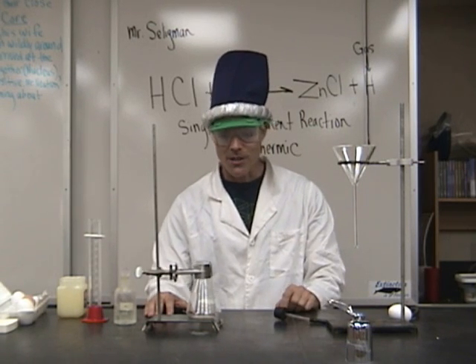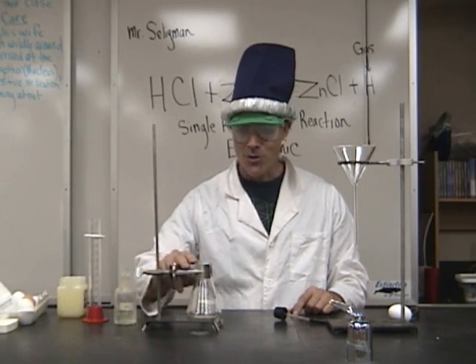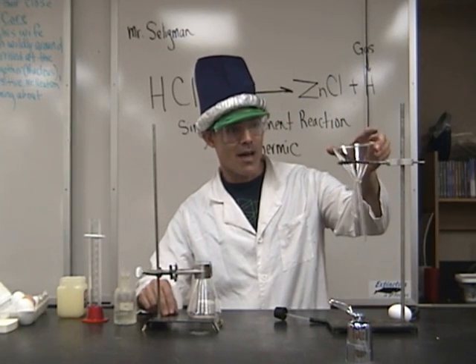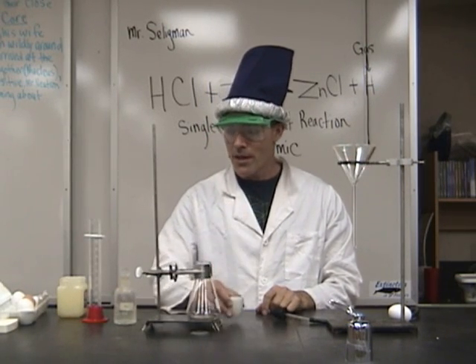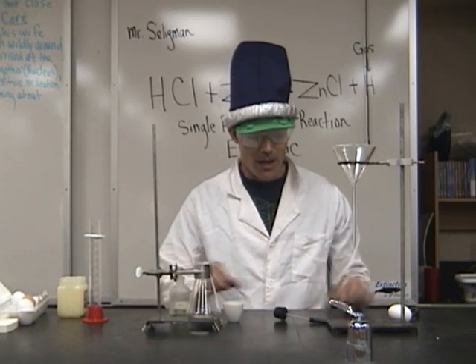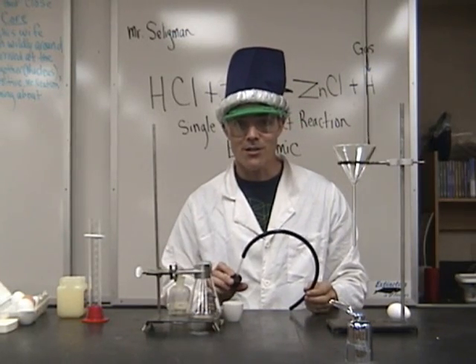Let's take a look at this demonstration. We have a number of pieces of equipment on the table here. We have a flask clamp attached to an Erlenmeyer flask, and a ring stand with a very thick glass funnel on top. I have some zinc inside of this baby crucible, some hydrochloric acid inside of this reagent bottle, and a rubber stopper with a glass tube and a rubber tube to be used as a gas collection device.